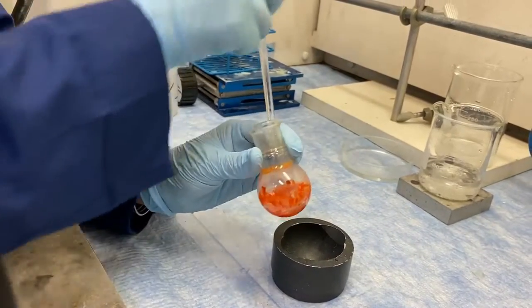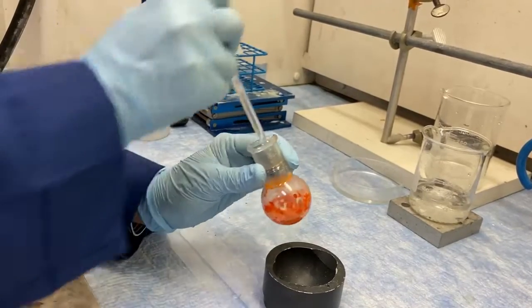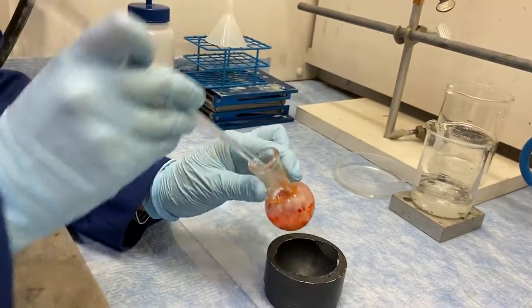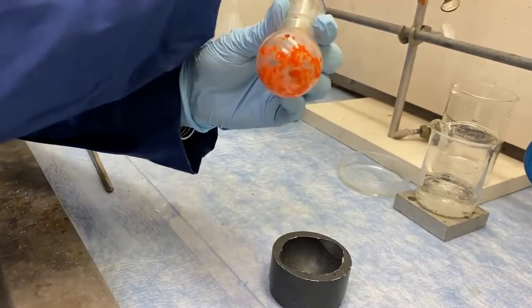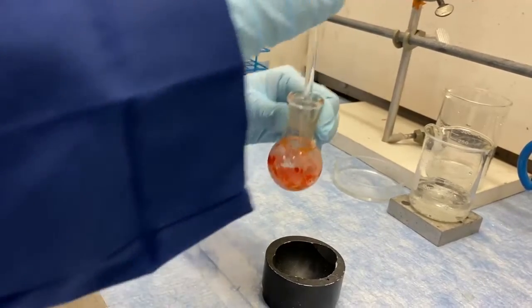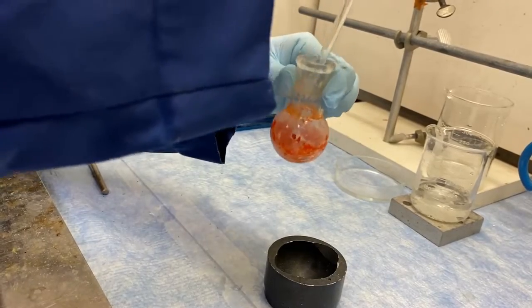Karen's been stirring this for a while until it gets to this powdery consistency. What we're looking at here is full conversion to the imine. At this point, or a little bit after this, we're going to take a melting point and an NMR. That is one of the NMRs that will be emailed out to you of the intermediate imine product.